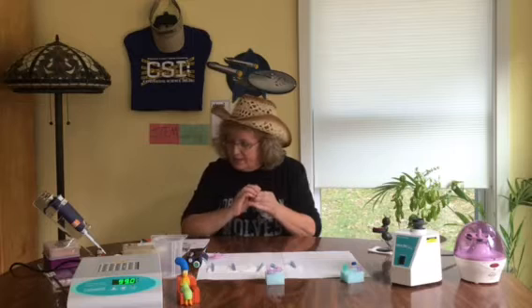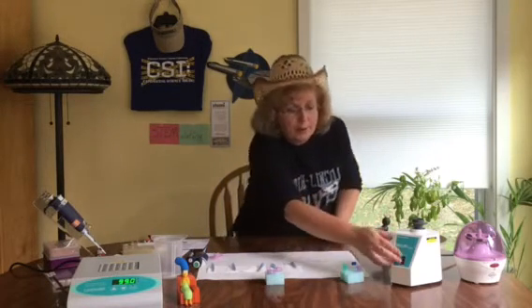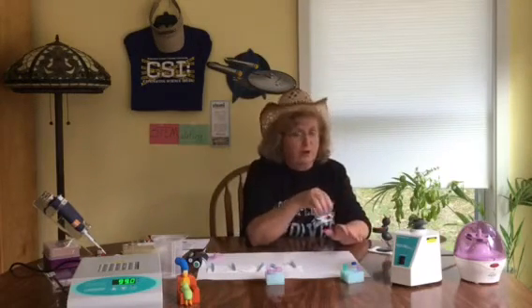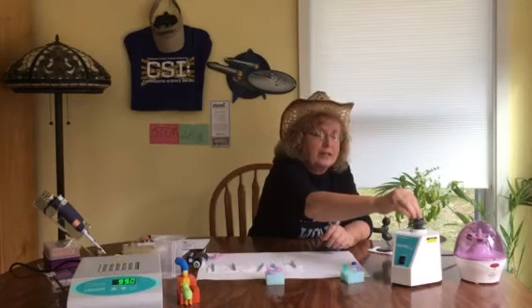Once you've added the Instagene, it says that you're supposed to vortex for 30 seconds. This is a vortexer. It just creates a miniature tornado. Once you turn it on, let the vortexer do the work. You do not have to push down really hard. Just stabilize it, and you do it for 30 seconds.